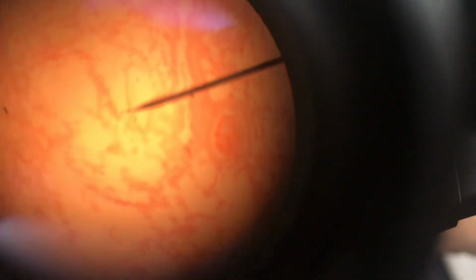I'm going to see if I can turn down the light a bit. Does that help? Okay, yeah, you can see the alveoli are kind of enlarged. They're thickened so that there's less gas exchange across all of the different walls, but you can see they're sort of blown up and exploded, so that's not great.